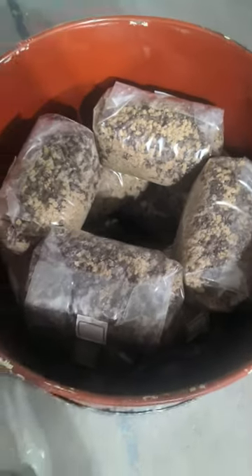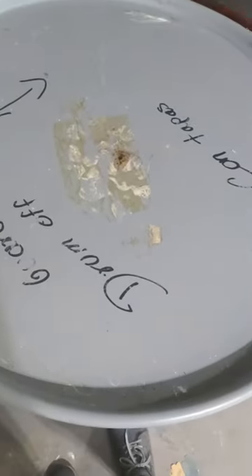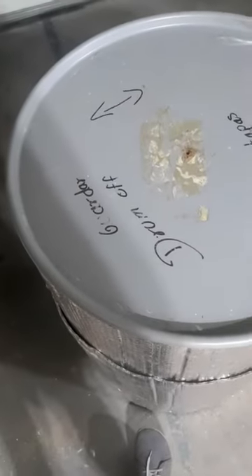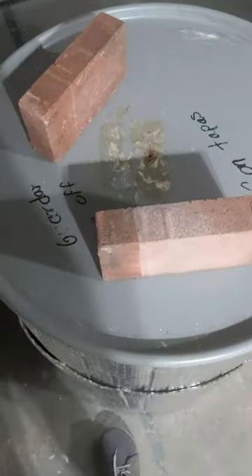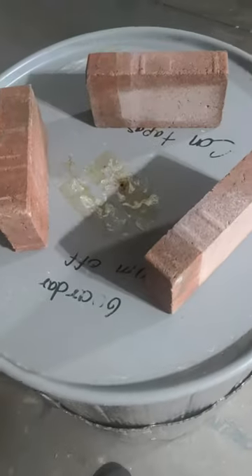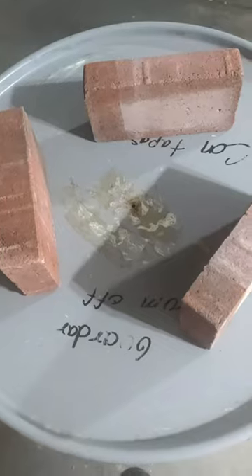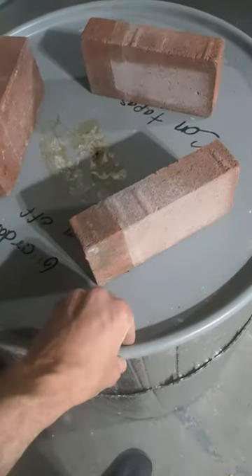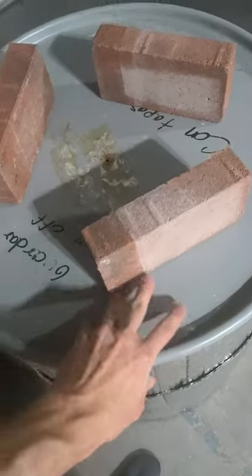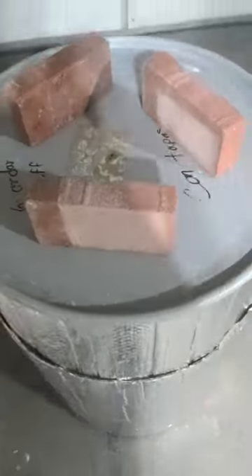Once the sterilizer is all loaded, throw the lid on and kind of push it down. And then instead of using the retaining ring I just throw three bricks on top. I did the math on this — even if the vent hole that I drilled were to get blocked, the max over-pressure this thing could hold is less than two tenths of a psi. So the outside of the lid will start to come up and steam can come out, so that way it doesn't blow up.